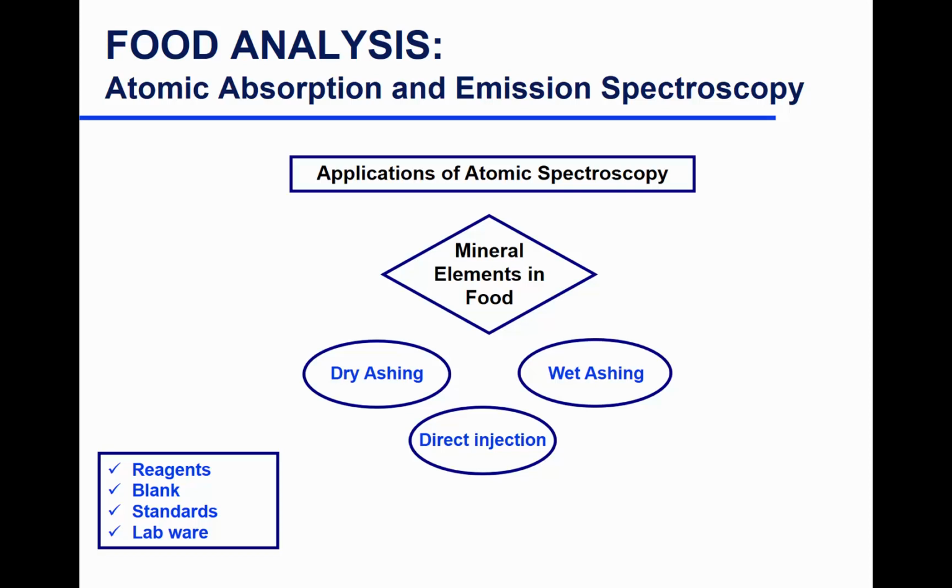You're right in terms of contamination. If there are any minerals that come from reagents, really, that you use, HCl mainly, and you also use lanthanum chloride. You'll learn about that if you haven't done the lab. So sometimes reagents do carry minerals in them, contaminants. So you have to have a blank that does not include your sample or your ashed sample, so that if there is any interference from a contaminant, you correct for that. You subtract the absorption of the blank from the absorption of the sample.